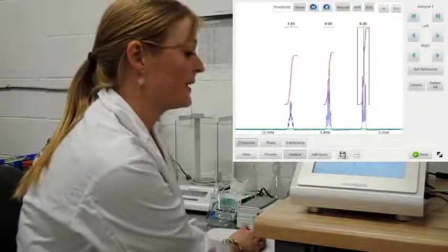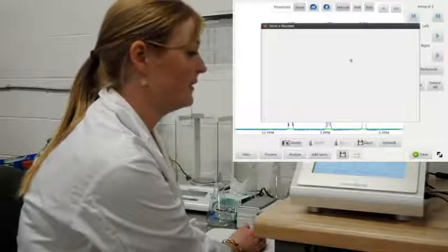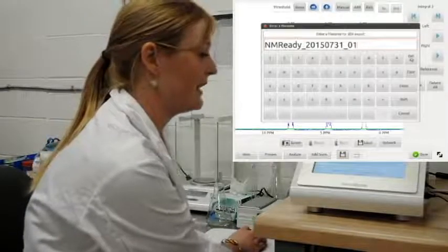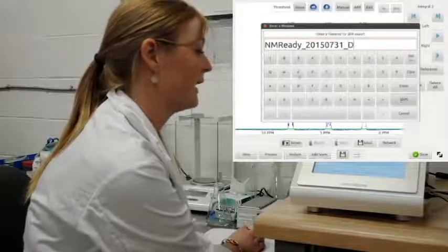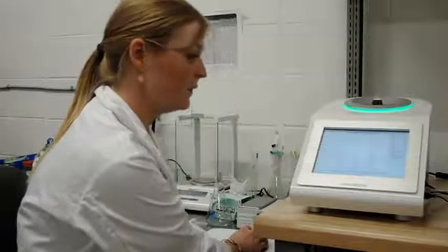And when I'm happy with what that looks like, I'm just going to save it directly to the unit. It automatically defaults to the date, and I can put in whatever name I would like and hit enter. Okay, so that's our first sample done.